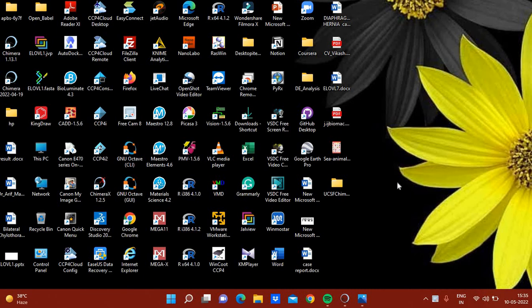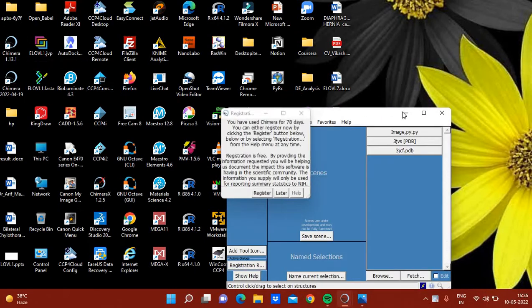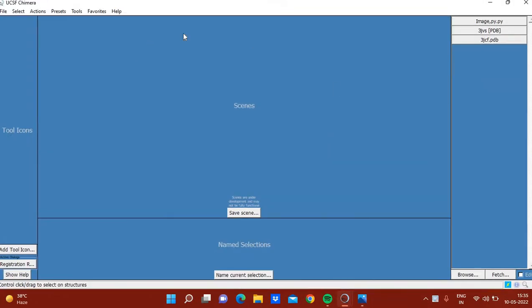Hello all. In this video I will show how to generate publication quality images using UCSF Chimera. To start, click on the camera icon to open Chimera. This is the main window of Chimera, and I will open a structure of human CHK1 checkpoint kinase one with an LH static inhibitor.